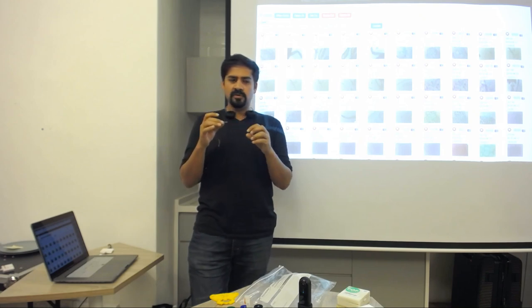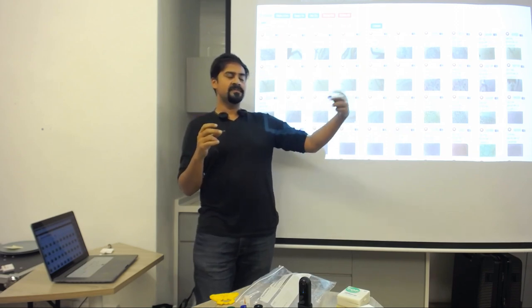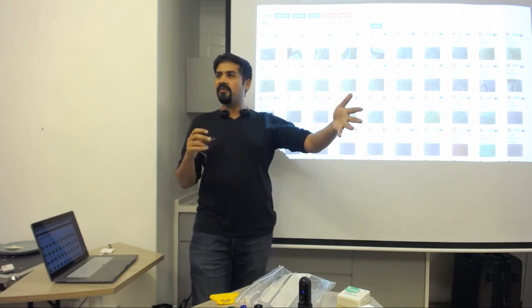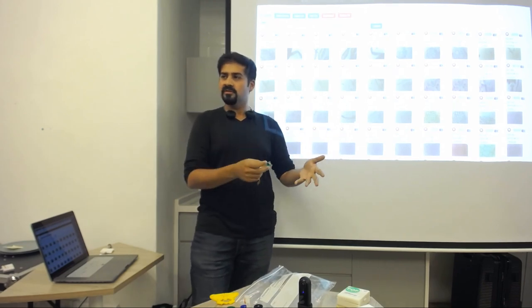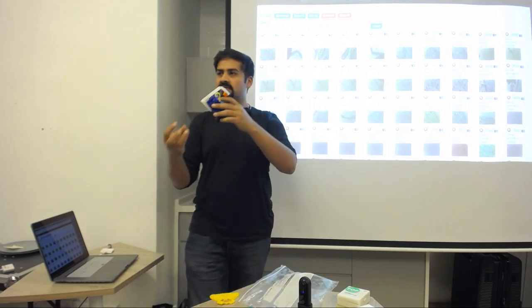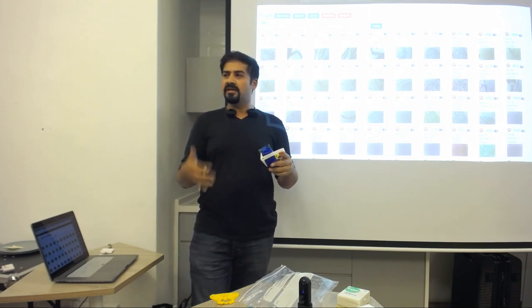If you look at the other designs, they were designed specifically to reuse the sort of lenses that you normally screw onto a microscope, like one of those lab microscopes. So if you happen to have one of those, or spare ones lying around that you want to observe digitally, you can always print that version. It's just bigger. It has a bigger cavity at the bottom, which lets you plug it in. So you repurpose whatever you already have to get whatever magnification you need.